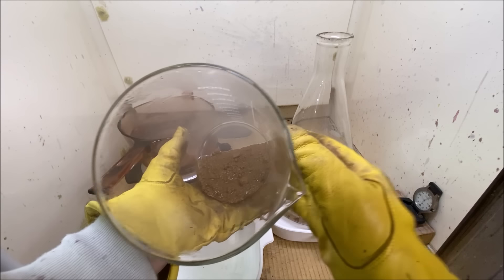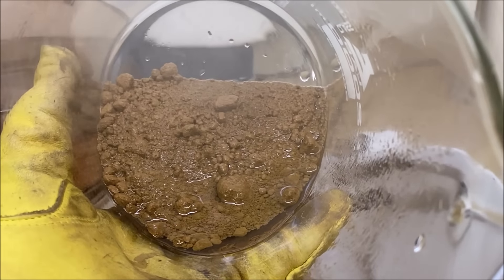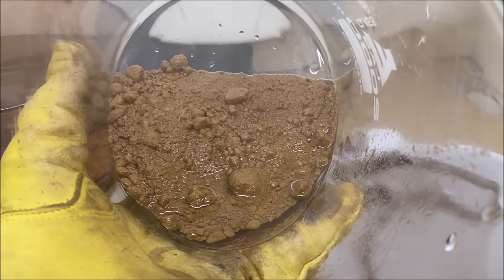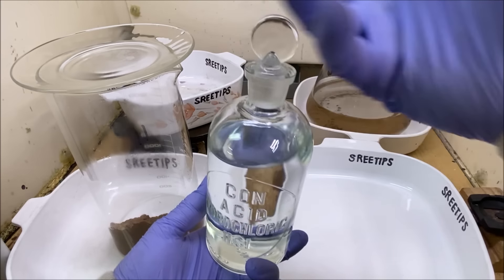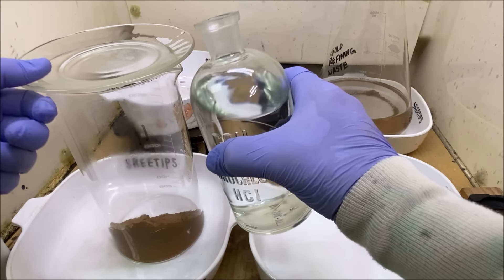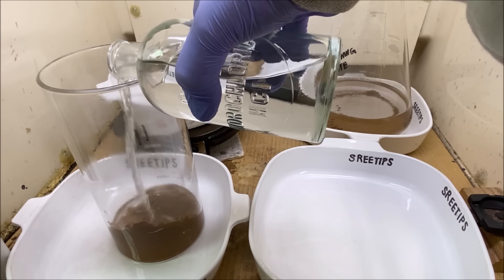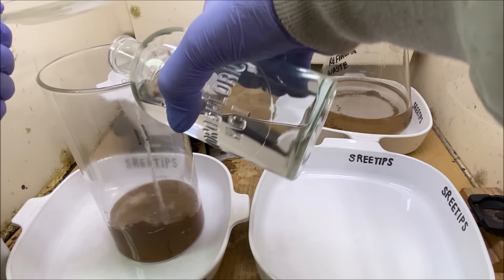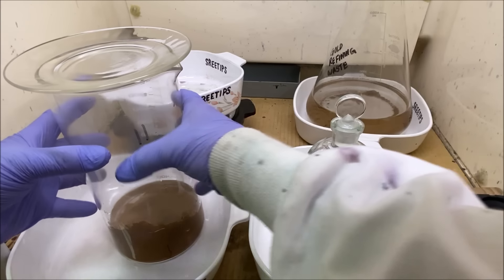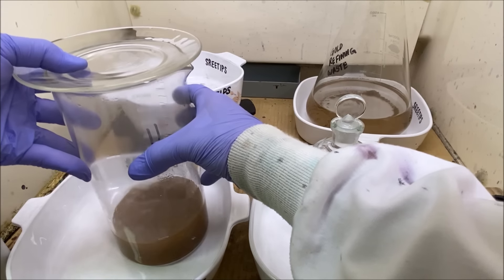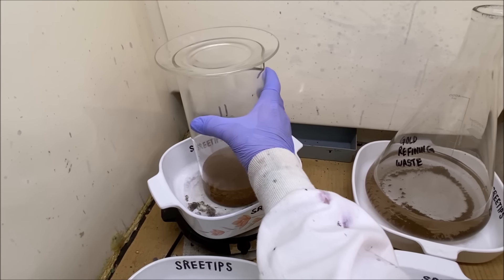Here's our gold down in our beaker. Look at that, man, looks beautiful. I've got some hydrochloric acid. We're going to boil the gold with some hydrochloric acid now. This will help remove any remaining iron that may be in there. Set that up on the heat and let it come to a boil.